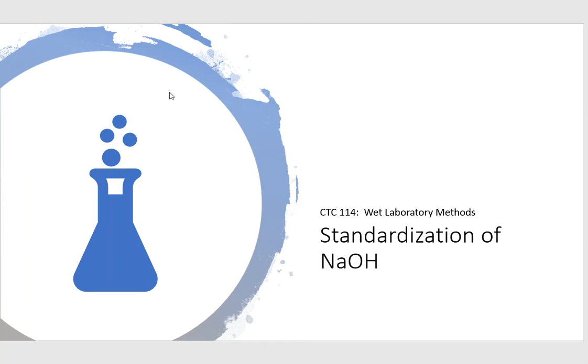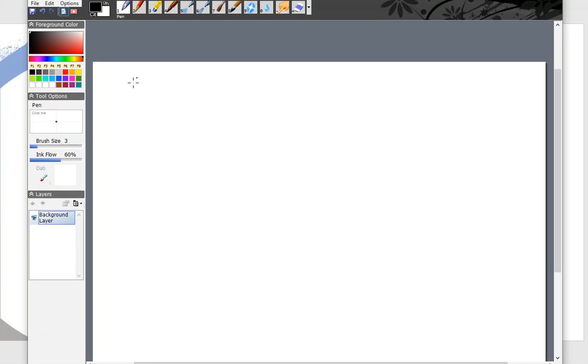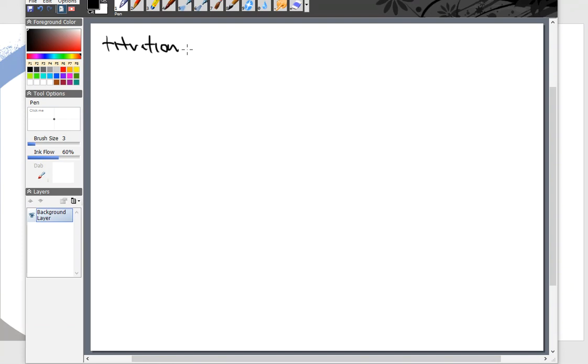So in a general chemistry class, especially in chemistry 152, most of the time, they talk about this topic, titration. Okay, so when it concerns titration, there's a few terms that we're going to have to talk about. And titration is a term. So I don't really want to start off this section without really telling you what a titration exactly is.